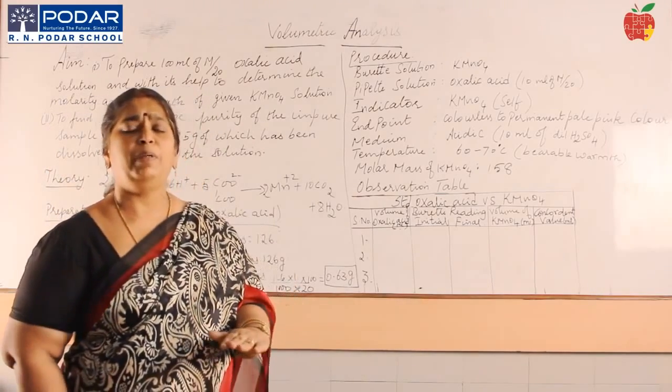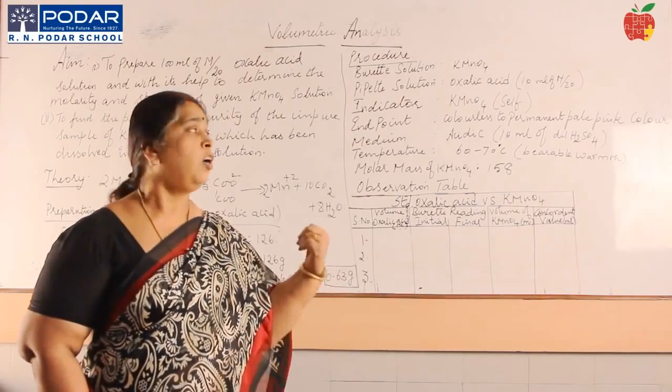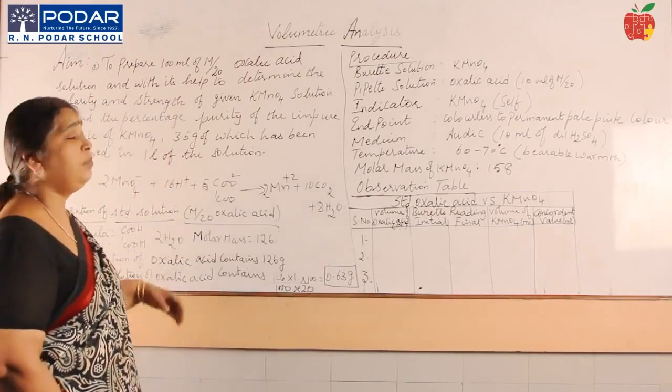The same question can be asked even in Mohr's salt solution. I am just giving you one example of purity with the oxalic acid. The same can be asked even with Mohr's salt solution. Okay, let us see what is the aim of our experiment.